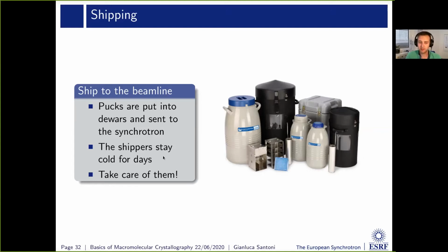These are very delicate objects, so you need to take care of them. First, they need not be knocked around, obviously. Mechanical shocks are very bad for them. They contain glass and a very sensitive metal sponge inside. Also, you need to dry them properly. After a few usages, probably two usages, they will be full of ice coming from the humidity of the air when you mount the crystal. So the best thing is to let them dry completely before cooling them down again.